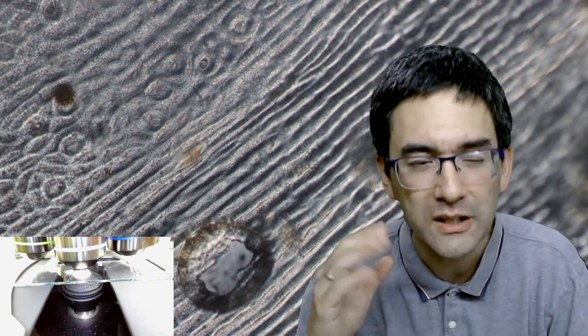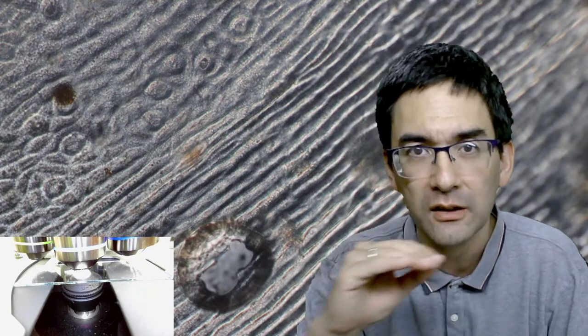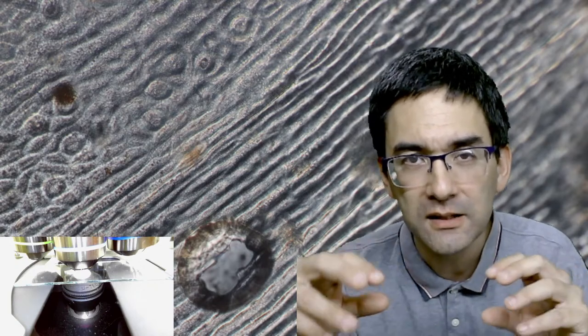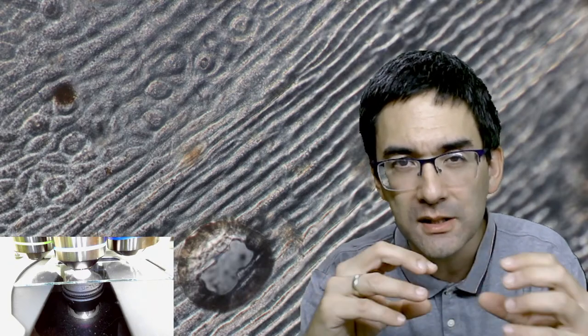Here again you're able to see the surface structure. Those parallel lines might be where there's vascular tissue. There's a comment - the stomata are connected to hollow structures within the leaf. When you take a cross section of a leaf there are different layers. The stomata lead into the so-called spongy mesophyll - that's the lower part of the leaf, which contains a lot of air spaces and loosely packed cell layers.